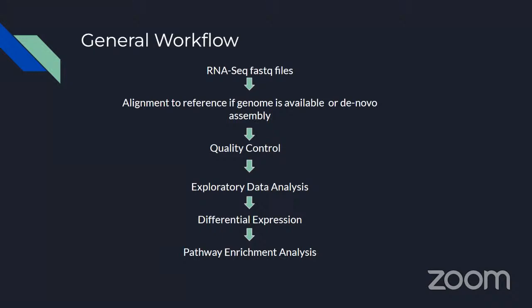For differential expression analysis, there are several tools which use different kinds of modeling. Today we'll be covering only exploratory data analysis, and then a bit of differential analysis, because I'll be using the tool that I generally use for differential expression analysis for the exploratory data analysis.